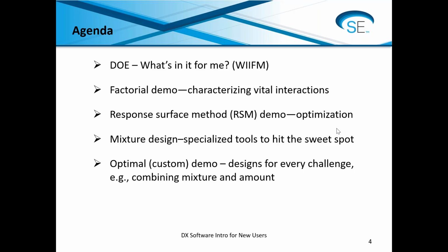But it goes on from there, and we'll learn how to optimize using response surface methods. And then we're going to re-aim this tool set toward the specific situation for mixtures. Formulation work has a couple of unique twists, and we need to refocus the tool set in order to work with mixtures. So that's where we're going to go.